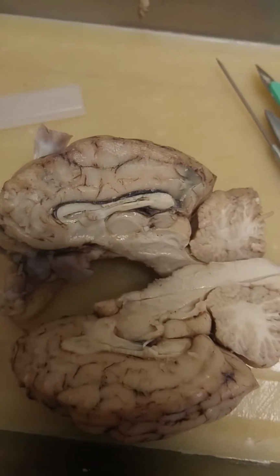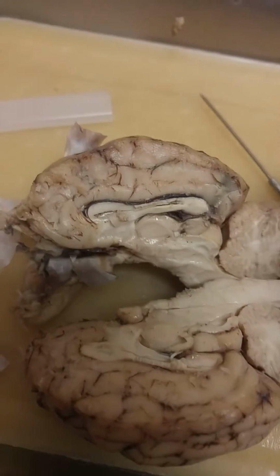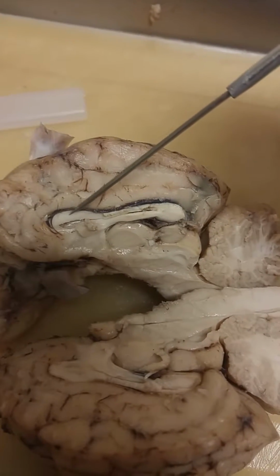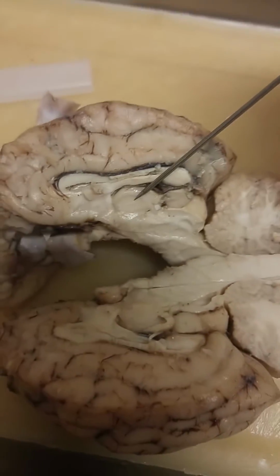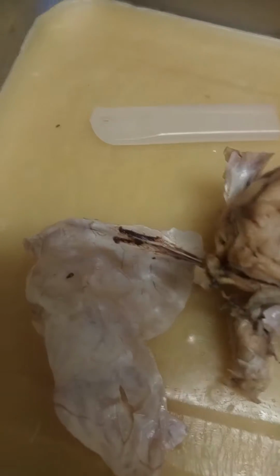Alright, so this was not very hard to cut down the middle. It was actually very smooth compared to the dura mater surrounding it. Right here we have the corpus callosum, this C-shaped figure in the middle of the brain. And here is the thalamus. Below that, this piece might be better actually to look at it.